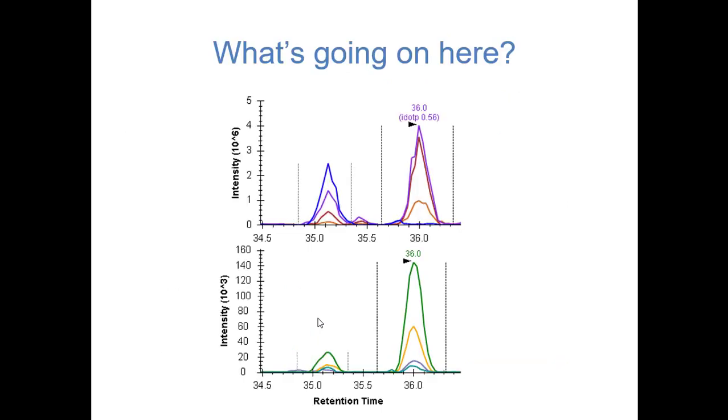So I've got an example here, and this is kind of an interesting peptide. I wanted to ask, what's going on here? We have to make the assumption that peptides don't elute multiple times, right? Otherwise, I think you're totally screwed with DIA. We have to assume that every peptide is going to come off the column once. But we see this nice signal in two different places, right?